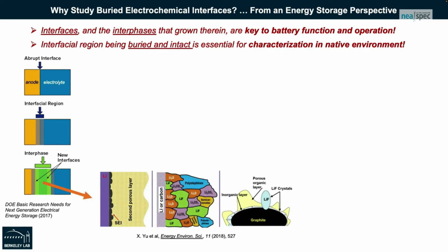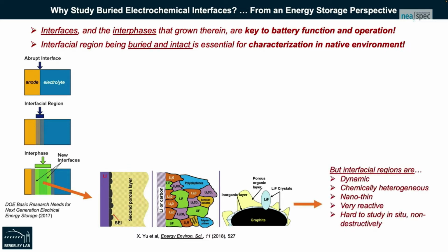Over the years, our state-of-the-art understanding of these interphases has changed dramatically. This is in large part because these interfaces are dynamic, chemically heterogeneous, nano-thin, and very reactive. In a nutshell, they're hard to study, especially in situ and especially non-destructively.